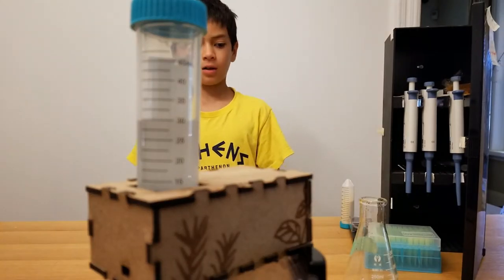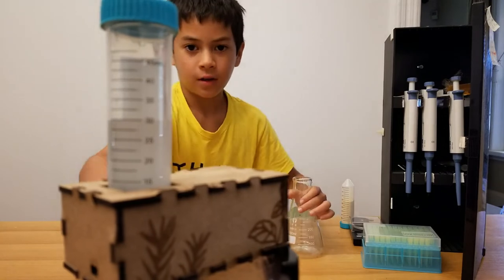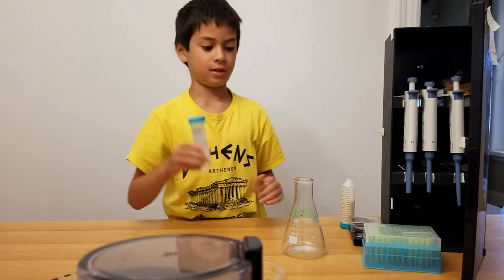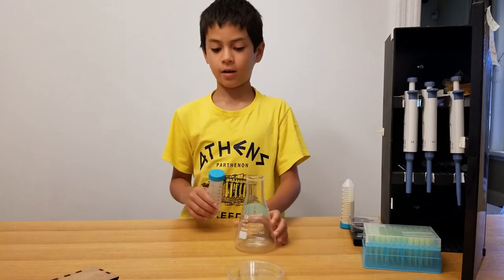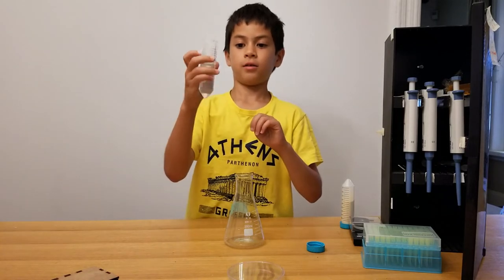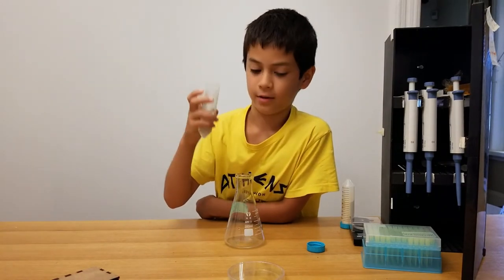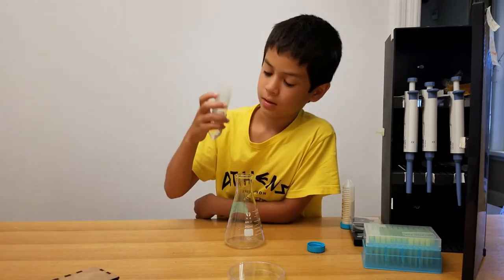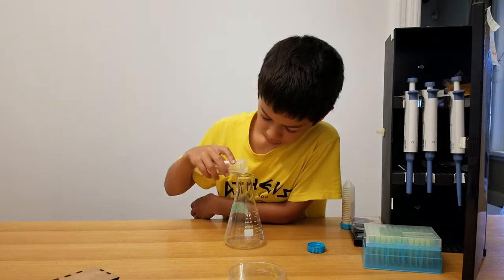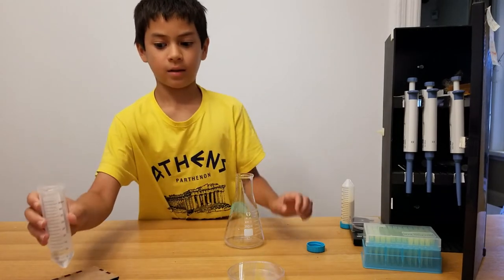We're gonna put the water inside the flask. It's at 30 milliliters right now and we're gonna use 10, so after we pour it should read 20. Now we're pouring — it's at 25, pouring a bit more — still not quite there — I think that's about 20, and now that's it.